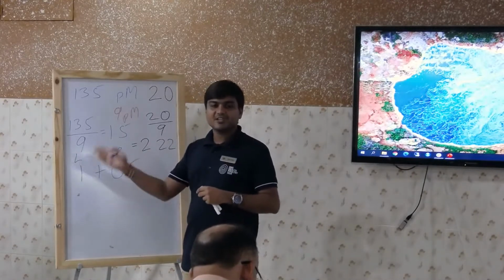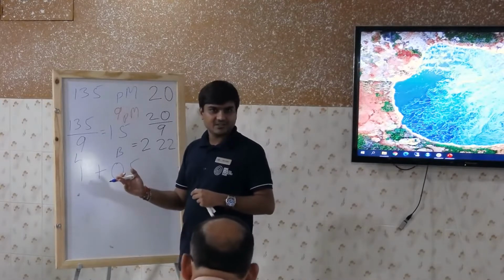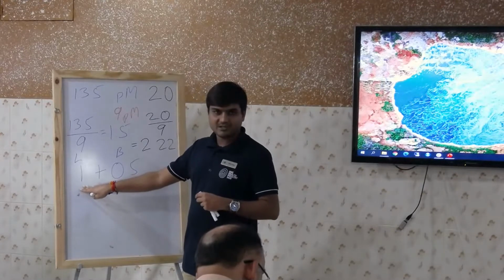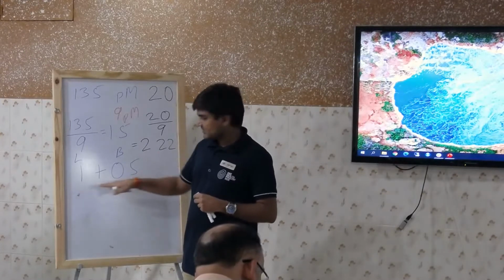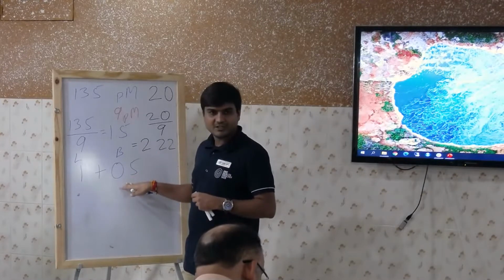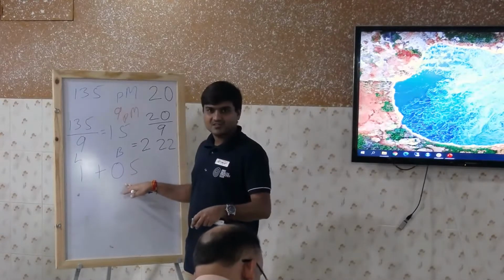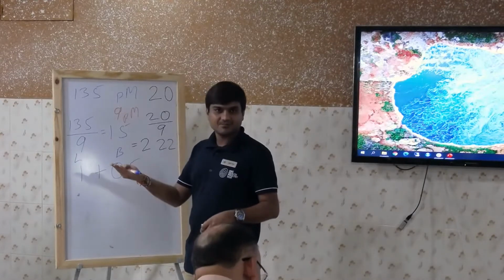Up till you reach minimum value of 650. So I can have 400 microliter of library, 200 microliter of buffer. That will give me 600. If I wanted exactly 650, similarly scale it up.